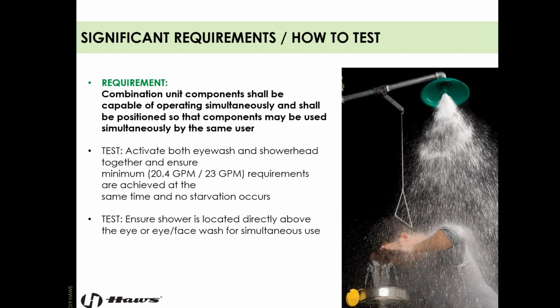With both of them activated, you'll see a dip in pressure to the Eyewash or the face wash, whatever's installed there. And now you need to decide, do I need the shower more? Do I need the Eyewash more? I need both of them at the same time, but they're not working at the same time. So make sure when you're testing, you're activating both.